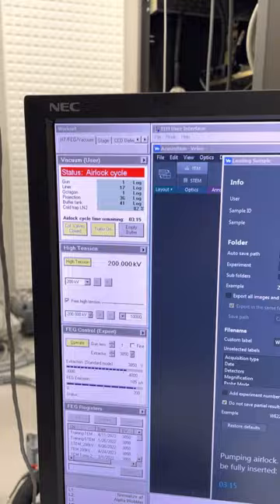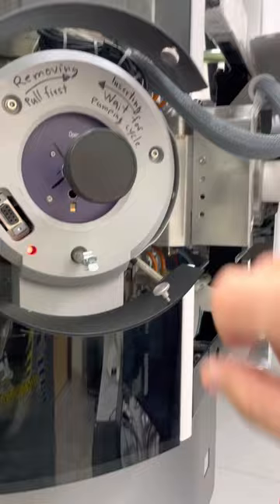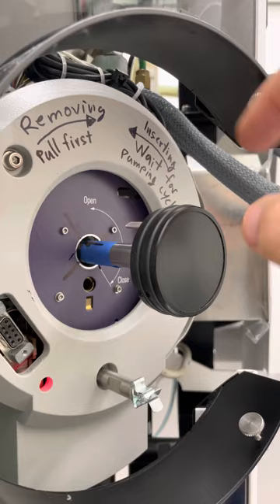Once you confirm the holder and once the time's up, this LED will turn off. Then that's the time to go to the next step, which is rotating the holder counterclockwise. When you rotate the holder counterclockwise, the pin that is now facing the closed position will rotate towards the open position, and the holder itself will open the column valves.